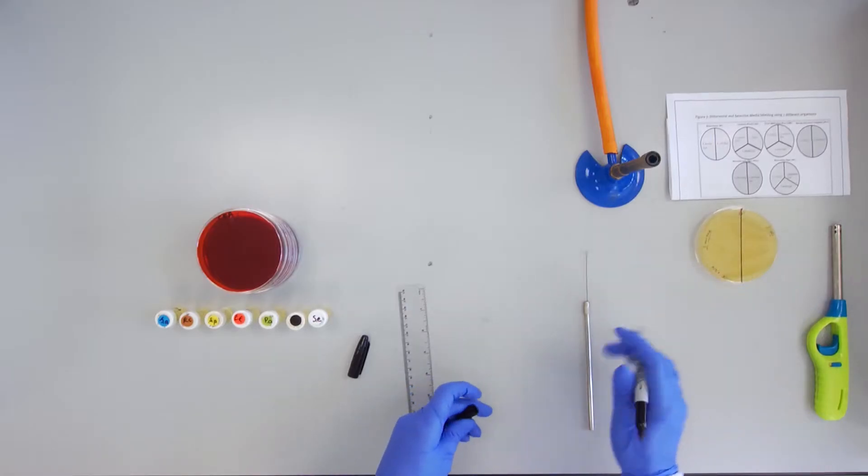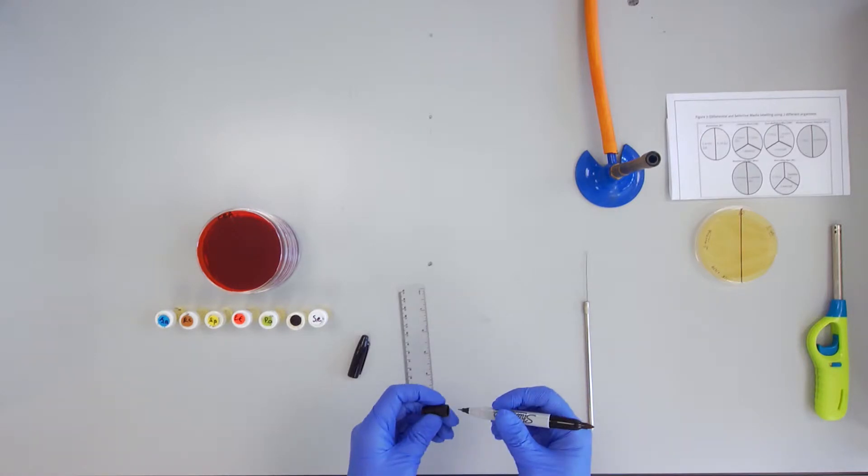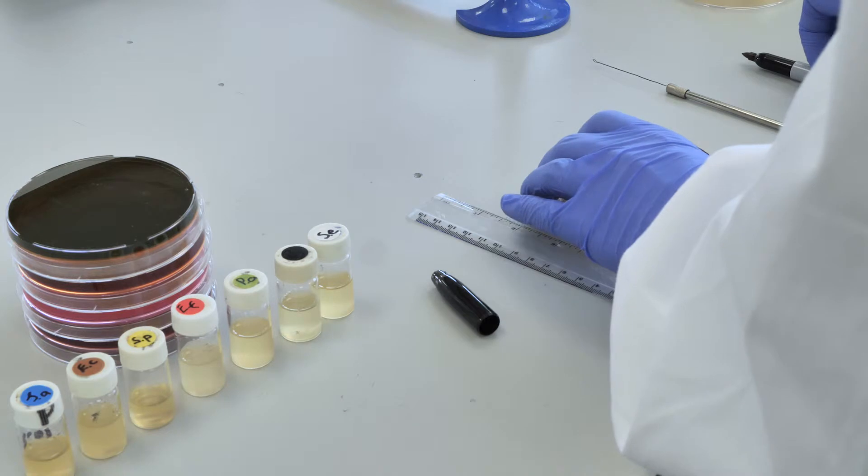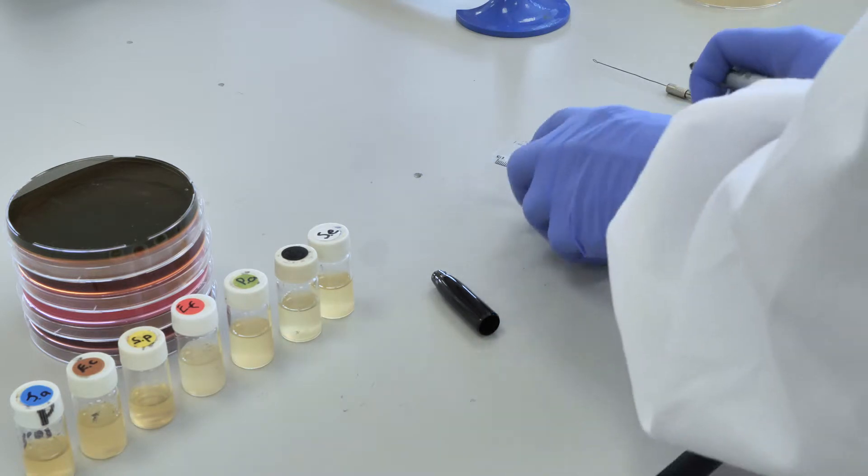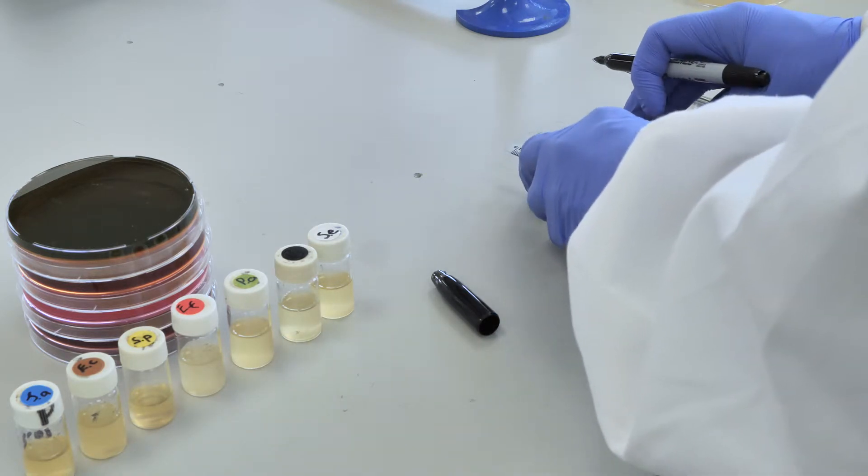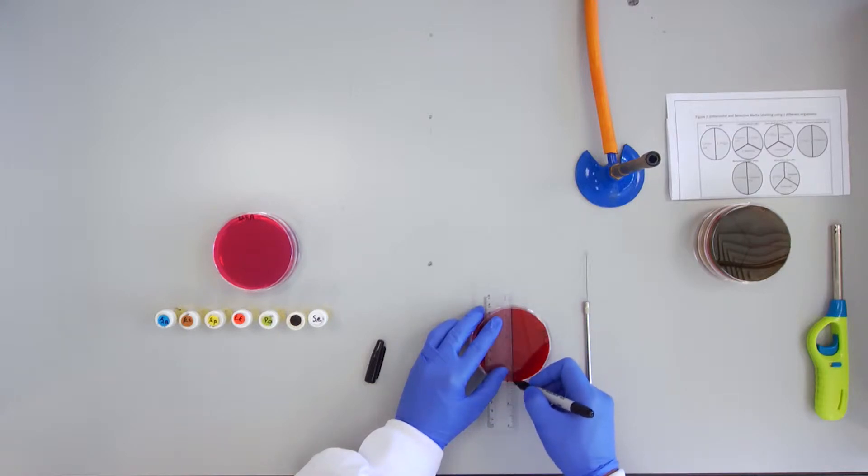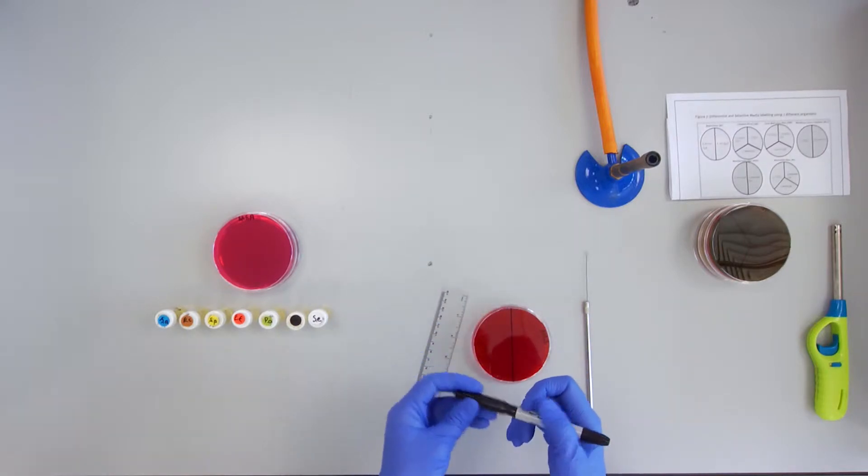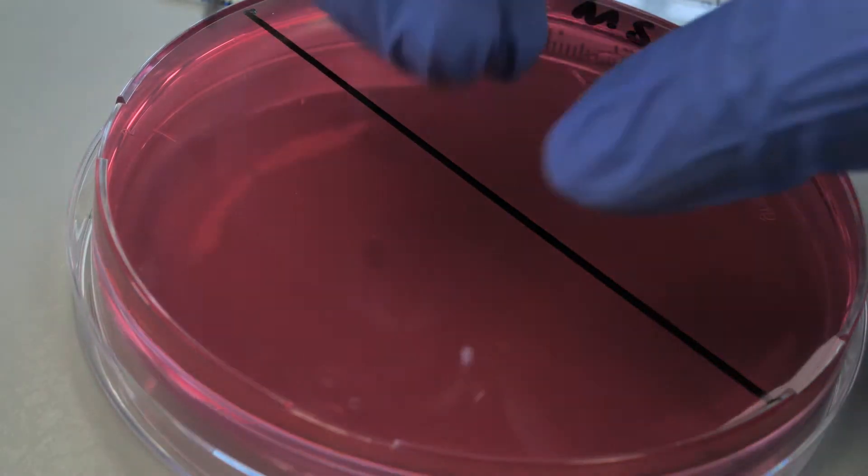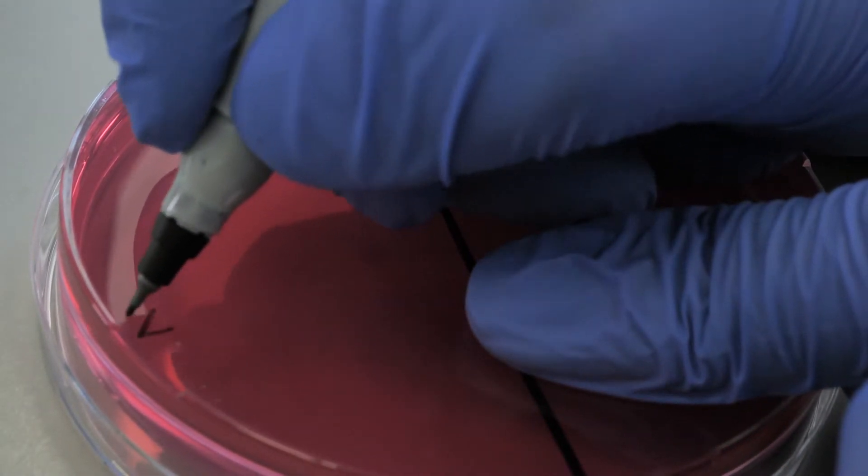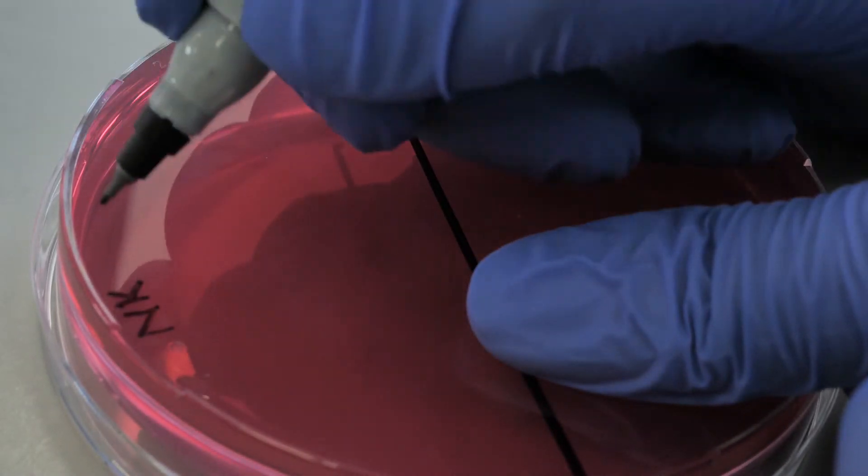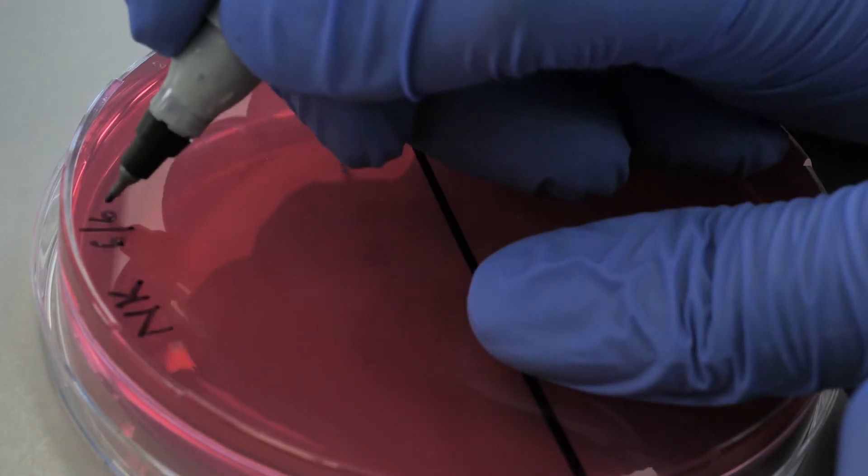Two or three cultures will be spread on each, so the plate must be divided into the correct number of sections and labeled with the cultures to be inoculated. Include your initials and the date on each plate also.